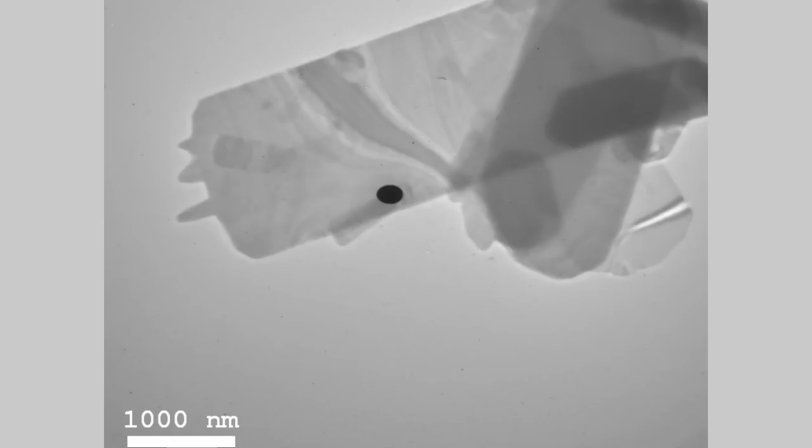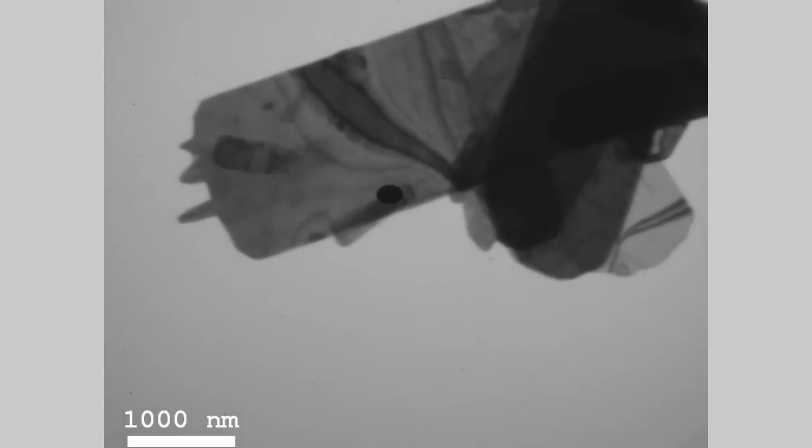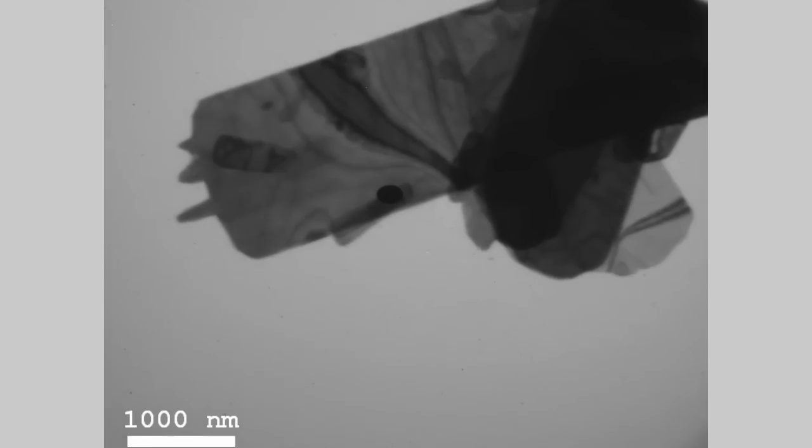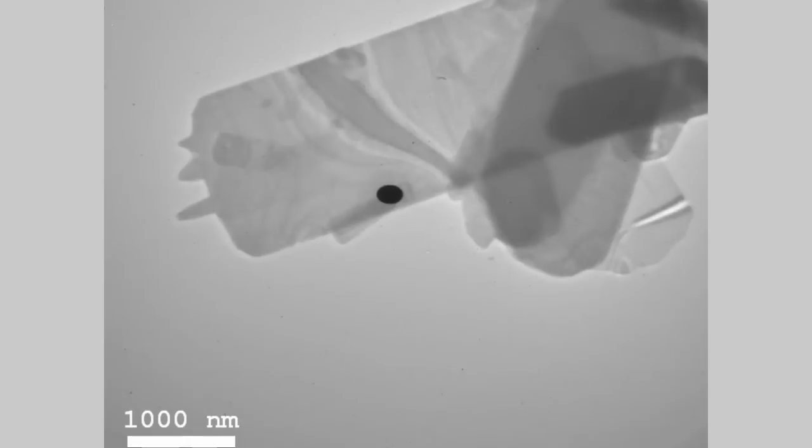I told you that the contrast in the image could be enhanced by putting in the objective aperture. We can try that. You see? The black things become more black. That means that the electrons that were deflected in the sample now have been filtered completely away and it never hits the fluorescent screen. You can increase or reduce this effect by choosing different sizes of the aperture. And then we are back at the beginning.